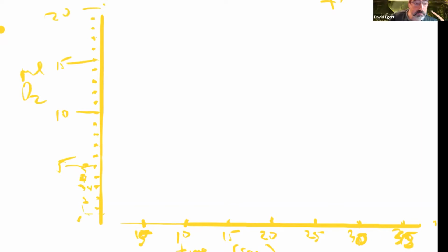So it is going to be important that you keep all of your axes well spaced, and definitely don't do what I just did where I had an asymmetrical thing here. Make sure that if from here to here is 5, the same distance has to be another 5, or else we're in trouble. So then we've got to draw our data.